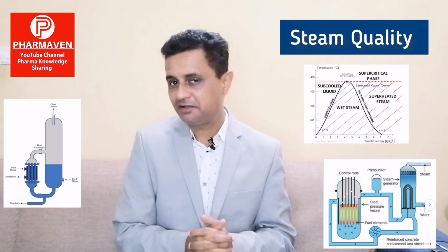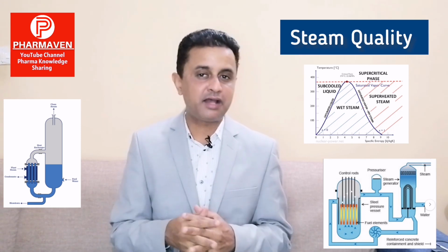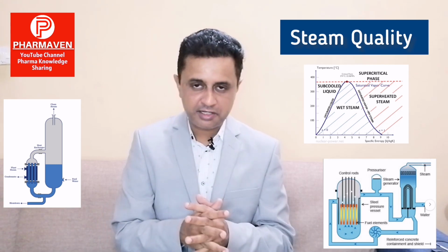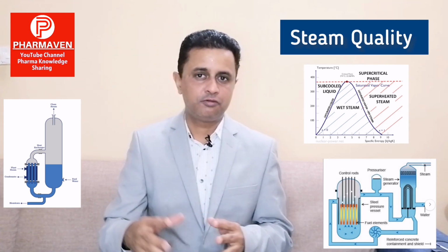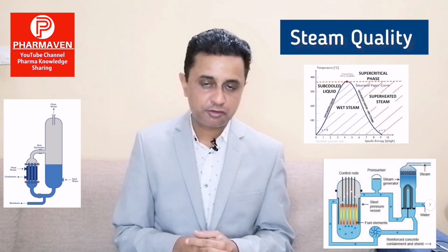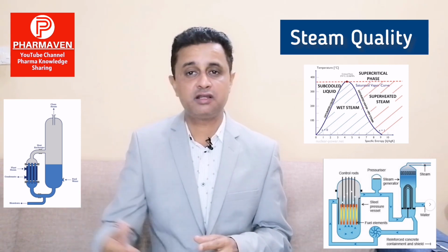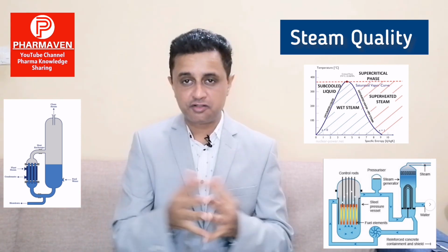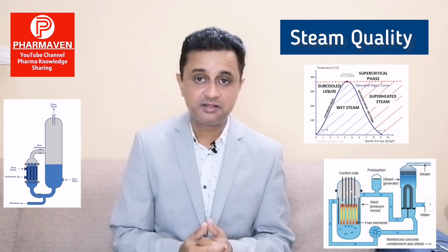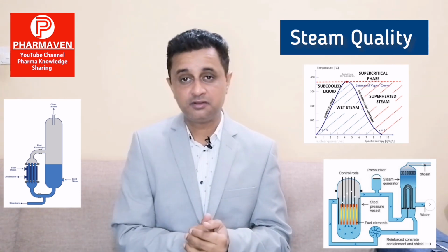If it is not meeting, then we can say there might be some issues with the steam quality or a high amount of steam condensate. So we can check the steam quality and derive certain conclusions. We may not find the exact root cause, but we may find a lot of contributing factors, on the basis of which we can derive our CAPAs. It can be instruction for proper placement, instruction to check steam quality, instruction to check steam pressure, addition of photographs, and training of the operators.